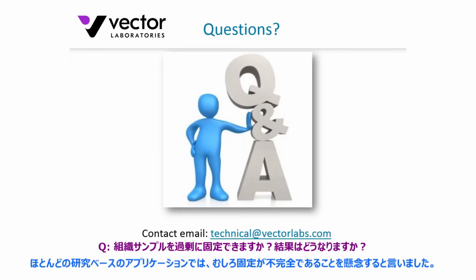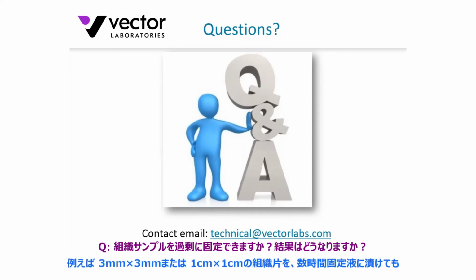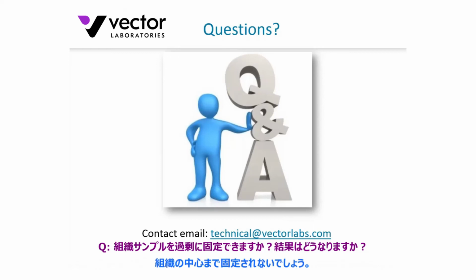And I would say in most research-based applications, the concern for me would be underfixation in the examples I gave, whereby investigators would not leave the tissue, say a chunk, I think I used the very scientific word, a chunk of tissue, something like, let's just say it's 3 millimeters by 3 millimeters, or a centimeter by 1 centimeter. They only put it in there for a couple of hours or a brief period of time, whereby the center of that tissue does not get fixed. Something like that, you may have to leave it in there for several days.